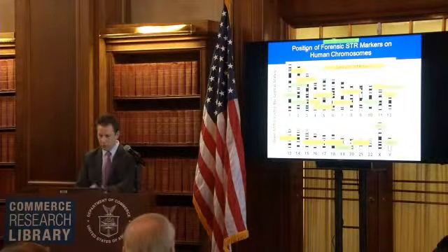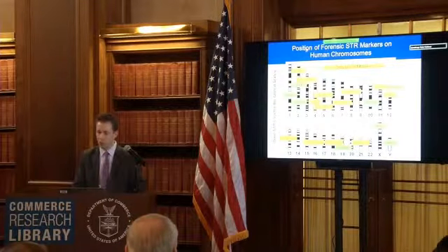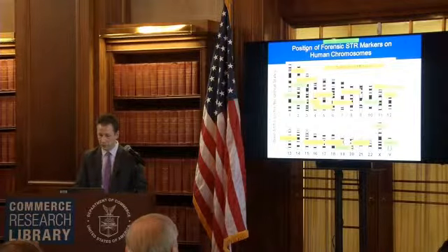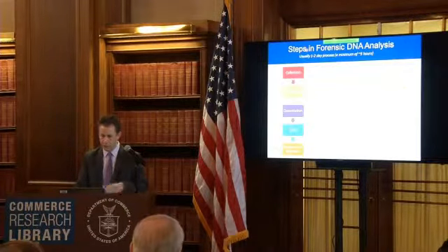So I think we're done with this one. I just wanted to get the point across that we're moving towards more markers in the United States for higher probability of matches and harmonization with Europe.